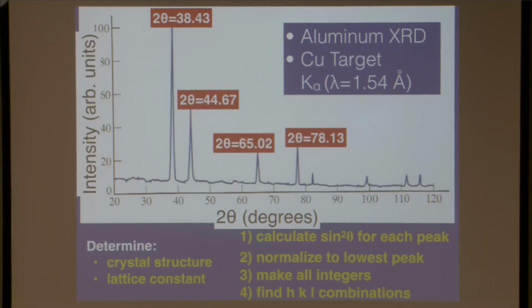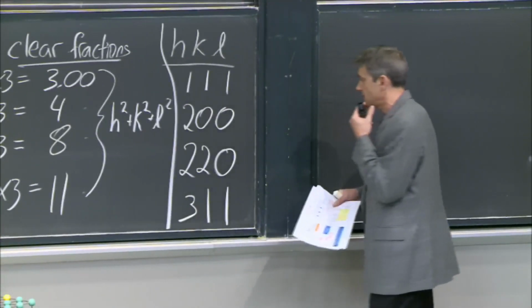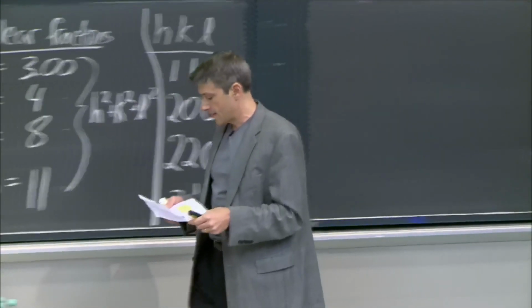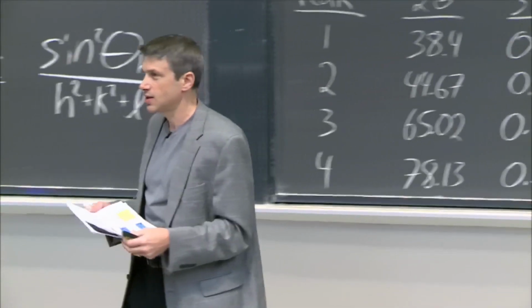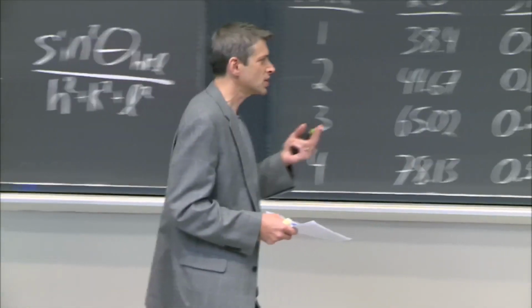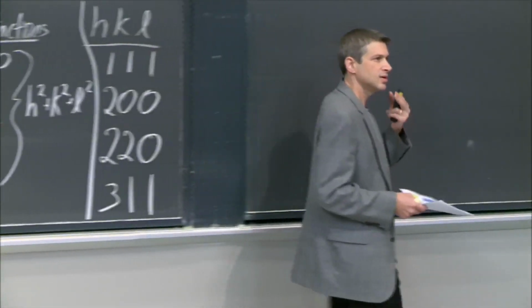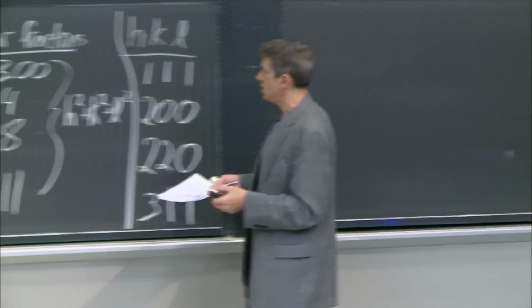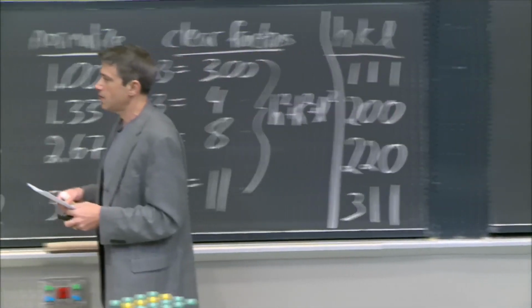Okay. All right, now, hold on. Now, have we determined the crystal structure? Have we determined the crystal structure? Can anybody say, how do we get the crystal structure from these peaks? Let's see, could it be BCC?